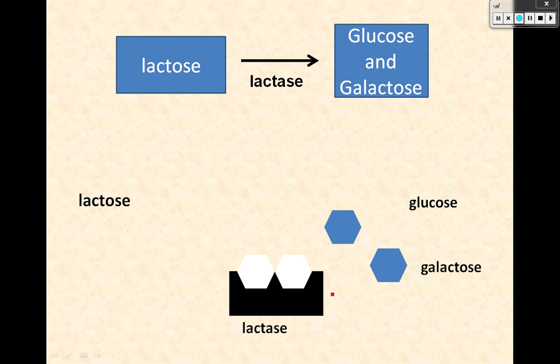It's going to be a lactase lab, and what we're looking at is how heat affects the ability of enzymes to do the work they need to do.